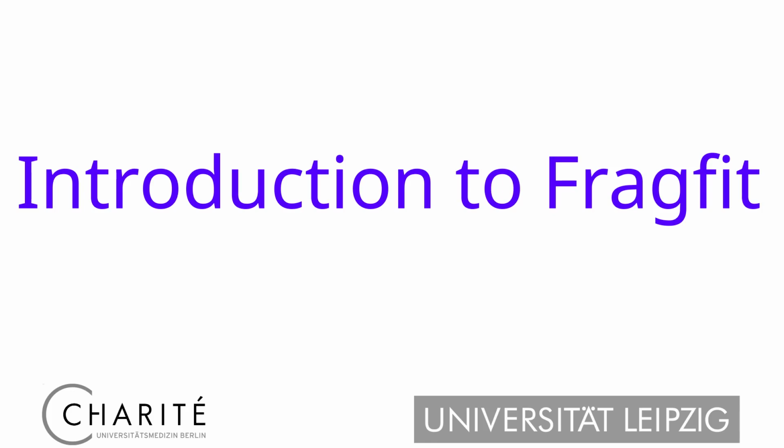This is an introduction to Fragfit. Fragfit is an interactive web service for guided modeling of missing segments such as loops or hinge regions into density maps. For this video we will use our own example.